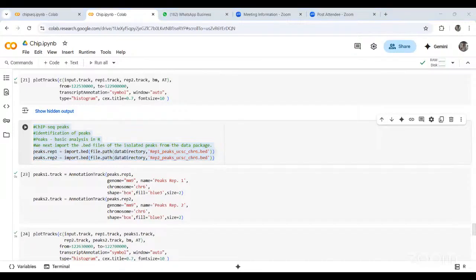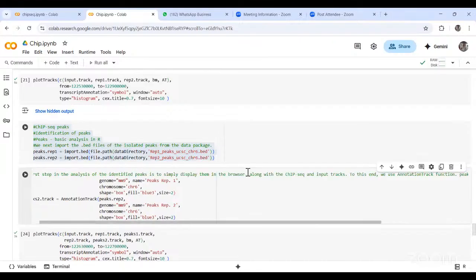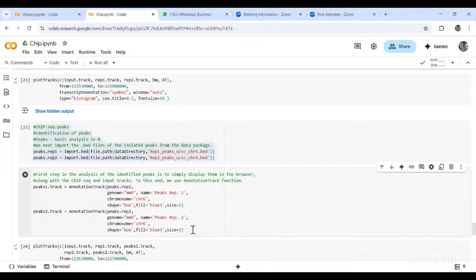It will hardly take a minute. You can execute it. I hope it is executed for everybody. It will hardly take a minute.